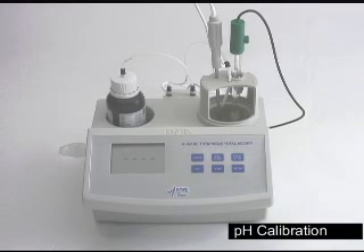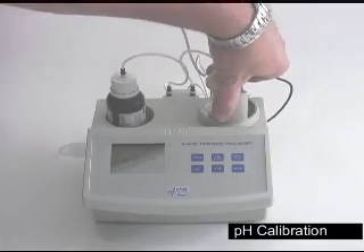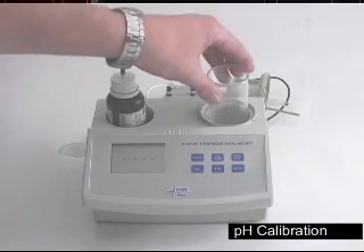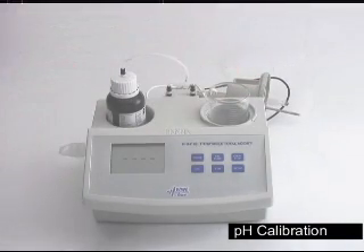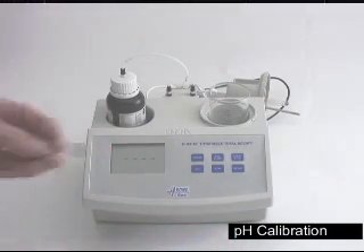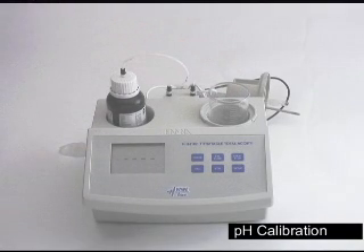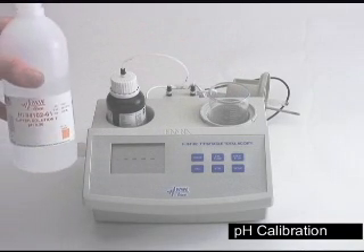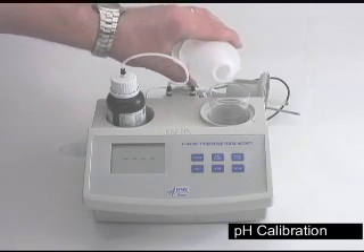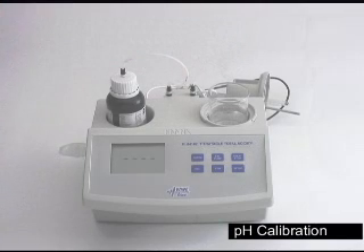The first thing we want to calibrate is going to be the pH. Remove the cap by twisting counter-clockwise half a turn and place it behind the unit. Place the beakers that have been provided into the top of the unit, making sure you add the stir bar. Fill the beaker halfway up — we're going to be using 8.2 pH buffer — and set aside.